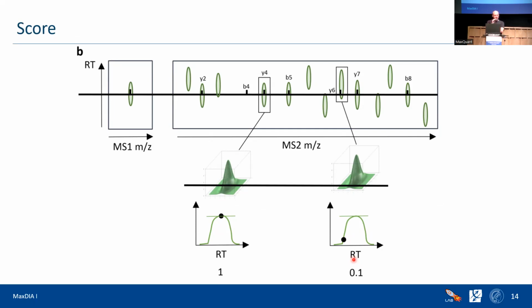You saw in the bootstrap workflow that we do many rounds of this matching. In the first round, we still do it exactly like this. But for all the other rounds, we now use a trained machine learning model to judge how good the match is. We're using a support vector machine there.